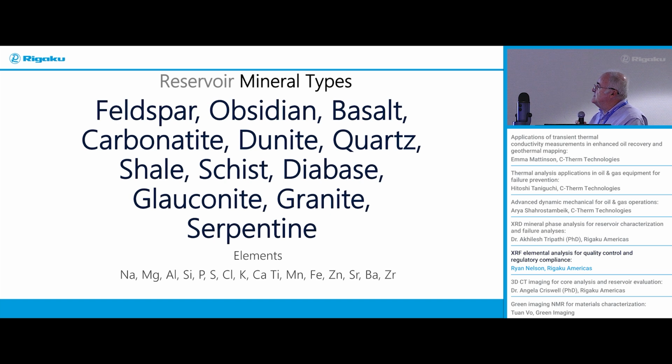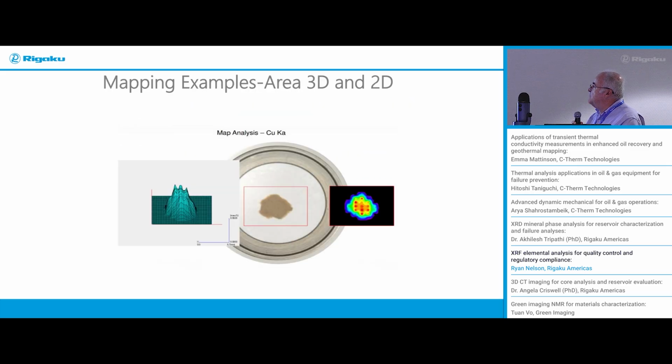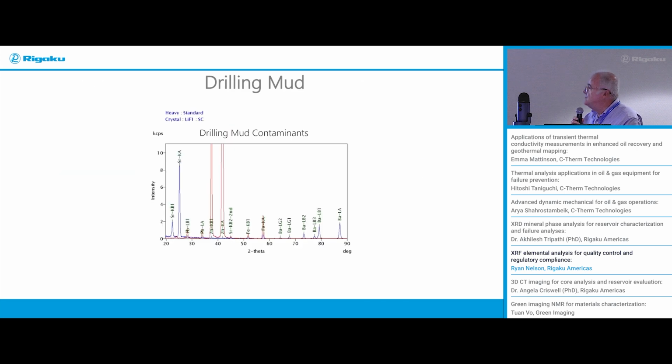Now looking at your rocks, I'm not an expert geologist, so grabbed a few things, but you can map, right, which we had already looked at. Also, there's many apps generated for this kind of analysis. And here's typical summary results, looking at biotite and looking at iron and high silicon and quartz. You can see very good results because you can get down to 0.5 millimeter with the machine. So you can look at these individual spots of interest on your sample.